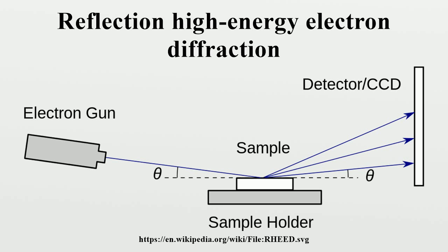These inelastically scattered electrons can reach the detector to yield Kikuchi diffraction patterns, which are useful for calculating diffraction conditions. Kikuchi patterns are characterized by lines connecting the intense diffraction points on a RHEED pattern. Figure 6 shows a RHEED pattern with visible Kikuchi lines.